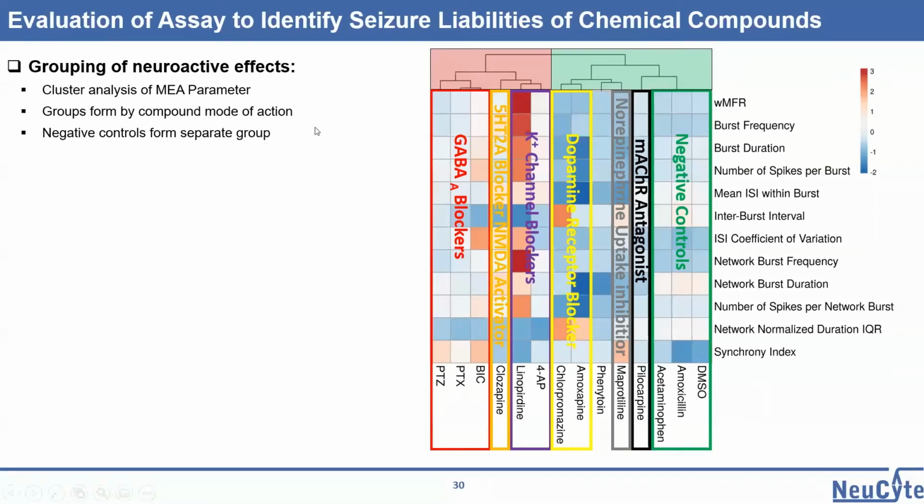We see responses in the pharmacological profiling to serotonin receptors and NMDA receptors, as well as strong responses to GABA A receptors and potassium channel blockers. And again, we see exactly that: those compounds that act through these modes of action can indeed be recognized in terms of being close to a seizure-like activity profile or pattern. Whereas for dopamine receptor, we tested it in our system, but it doesn't seem to be functionally integrated, although it is expressed, at least the D2 receptor.